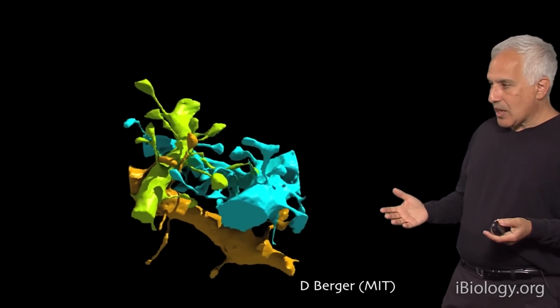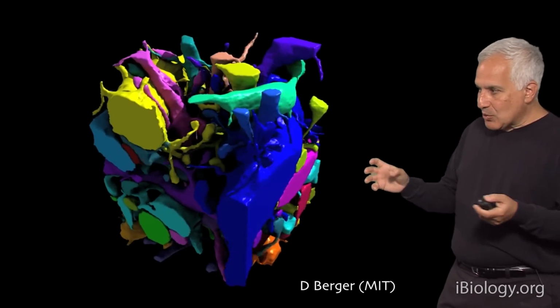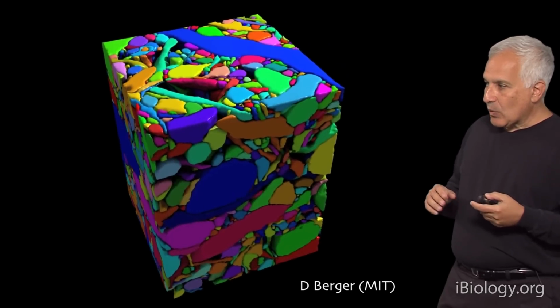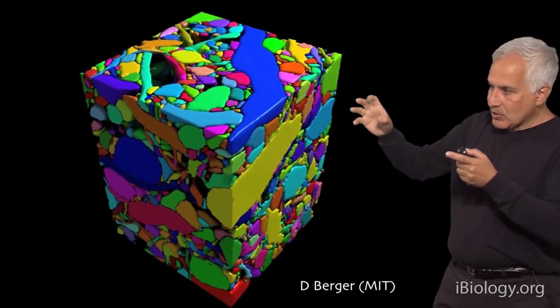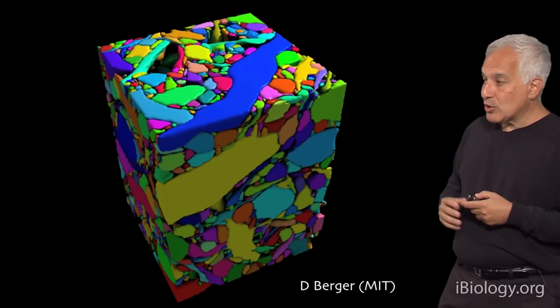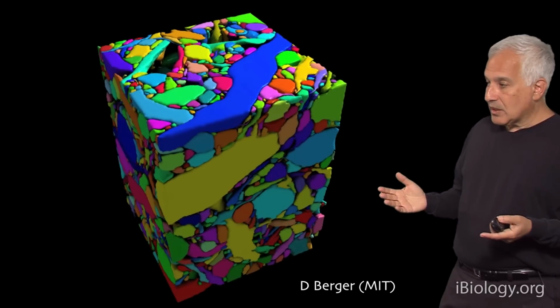This is the same data exactly. These are all those dendrites with their spines. And then packed in between them are lots of little axons that are making connections with them. And what's left out are the glial cells. Those are the little cavities you see, and there's not that much glial stuff in there relative to neuropil, as it's called. That looks impressive, but it's really useless.